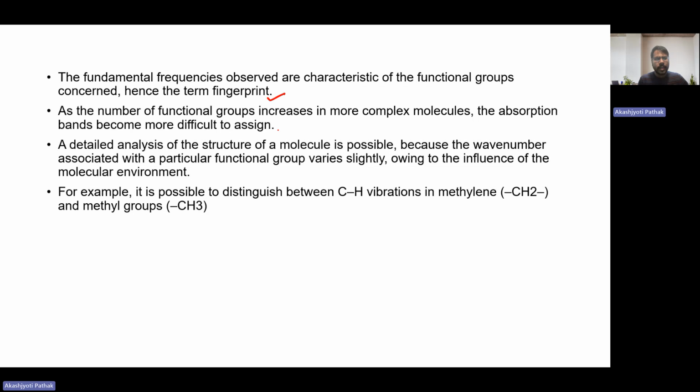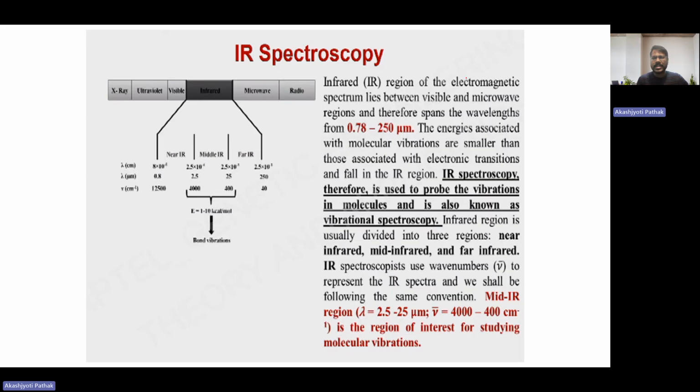The one that is absorbed will not reach the detector, isn't it? As the number of functional groups increases in more complex molecules, the absorption bands become more difficult to assign. We will discuss this in detail when we discuss the fingerprint. So let's go through the lecture slides.